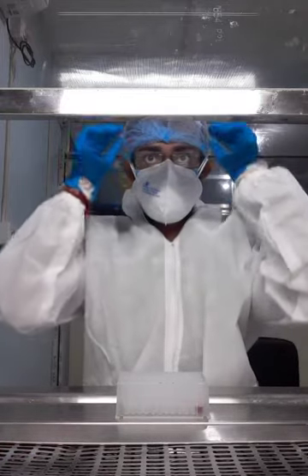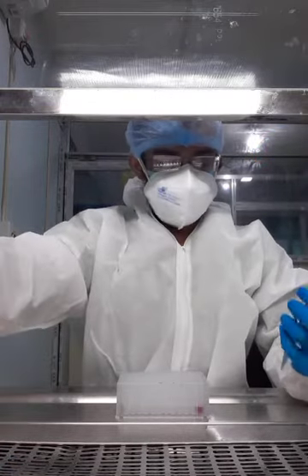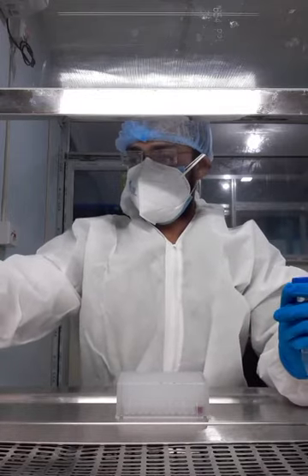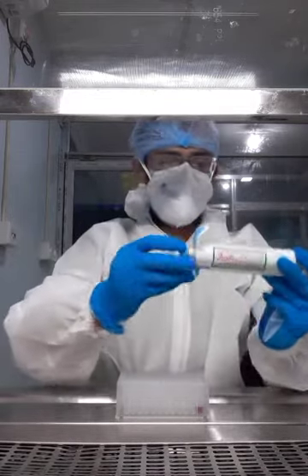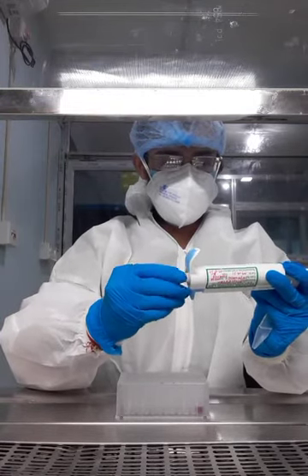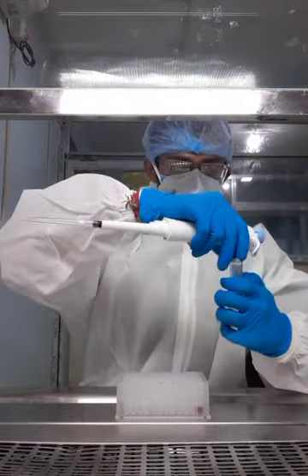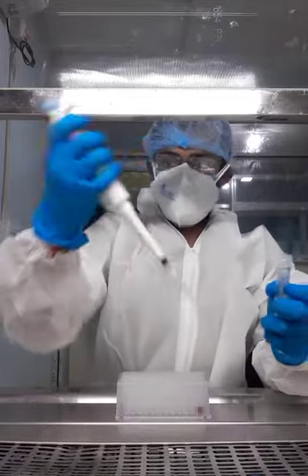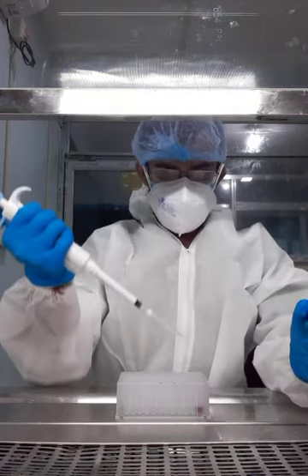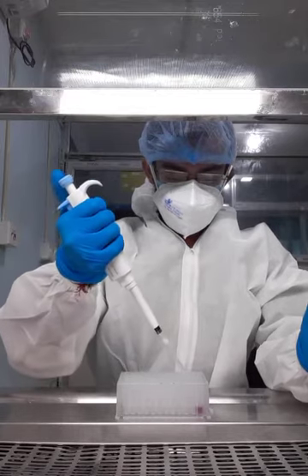Now our second step is to add 500 microliter of 70% ethanol. 500 microliter, 70% ethanol in column 2 for patient A.